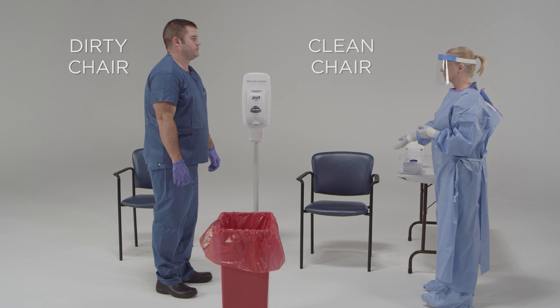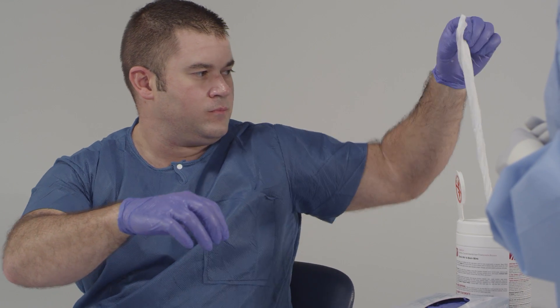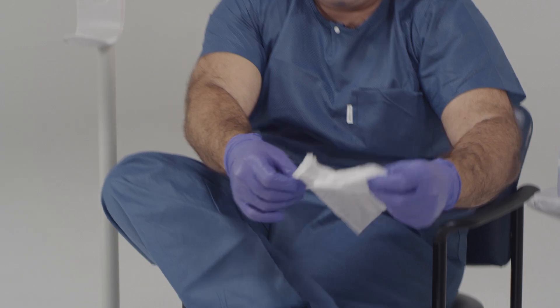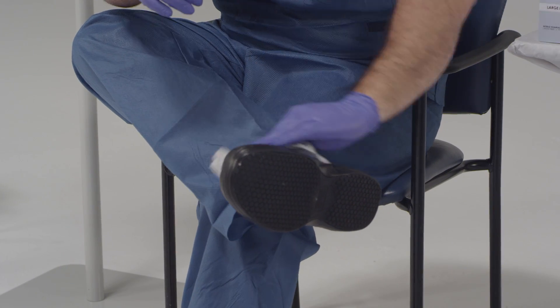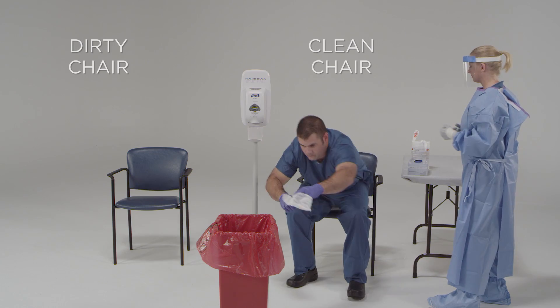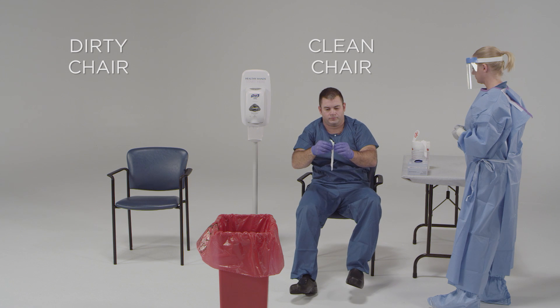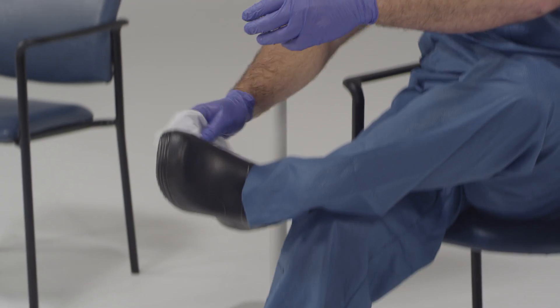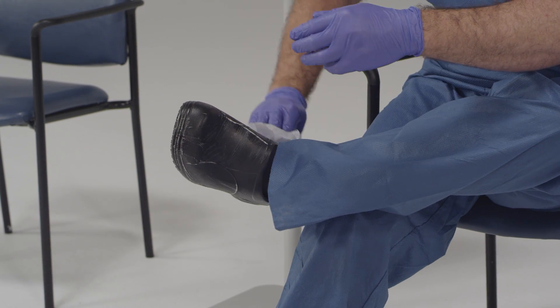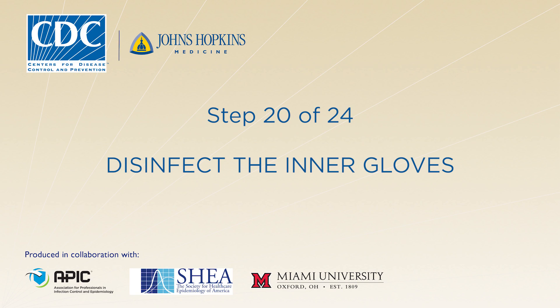Please have a seat in the clean chair so that you can disinfect your shoes. Sit down in the clean chair — this will be designated as the clean chair. Once you're sitting down, use the EPA-registered disinfectant wipes to thoroughly disinfect all the surfaces of your shoes, moving from top to bottom and including the soles. Be sure not to touch your ankles. Now disinfect your gloves.